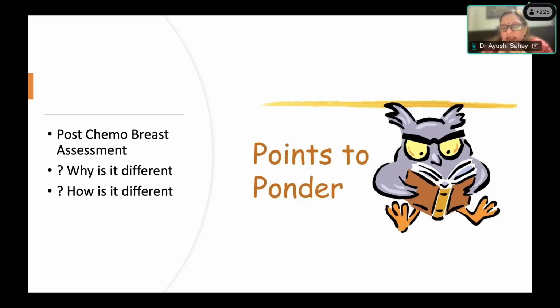So the major difference is that whereas in the upfront specimen, the tumor is very easy to identify, in a post-chemo specimen, the tumor or the tumor bed is very, very difficult to identify. The more a tumor responds to the chemo, the harder the job of the pathologist to identify where the tumor is and what the T size is. So your gross T size, your gross distances from margins and the various other landmarks are not as sacrosanct as they are in an upfront specimen.